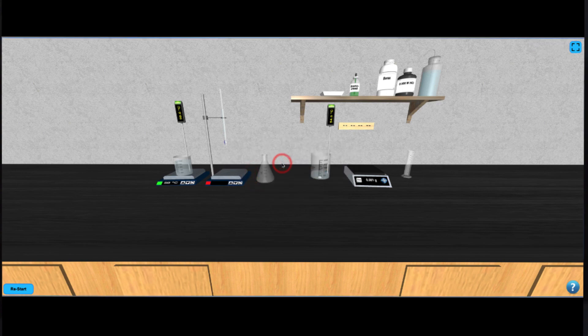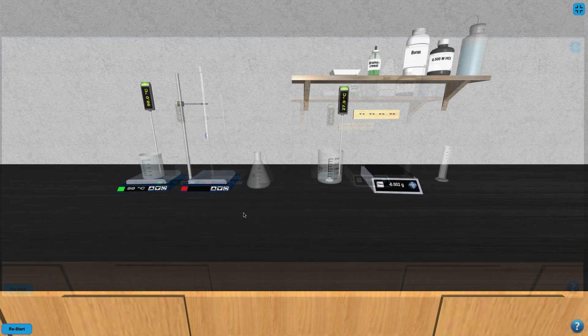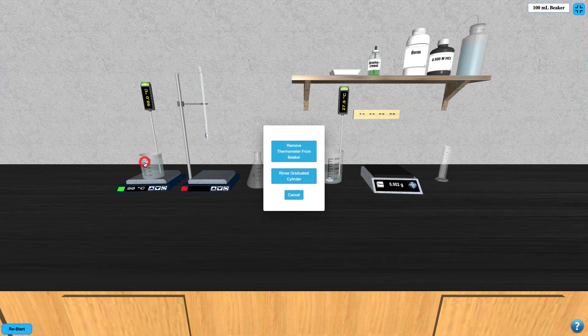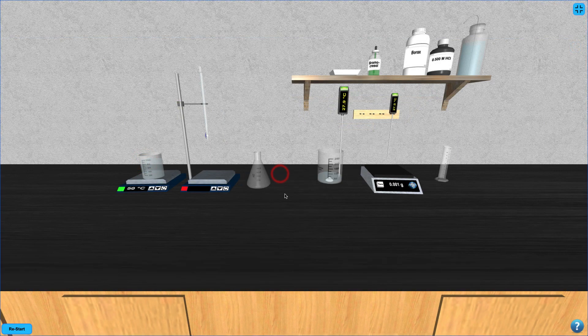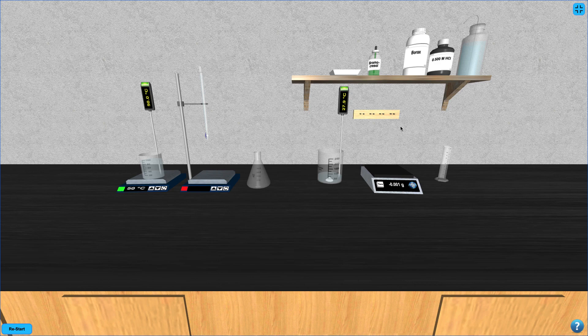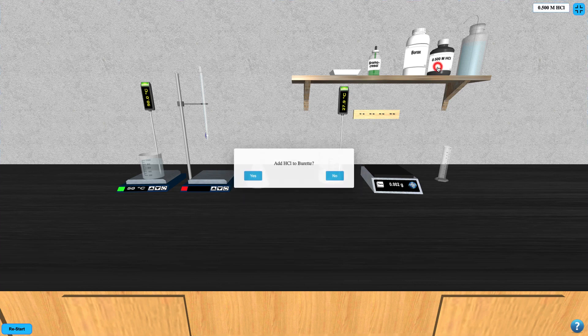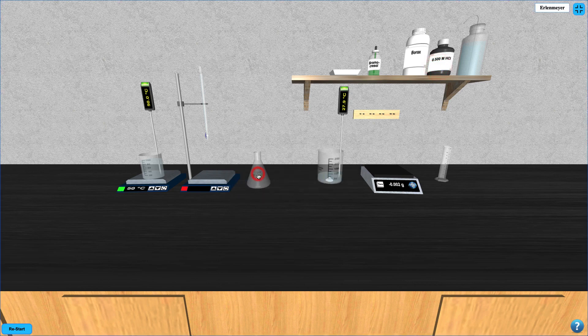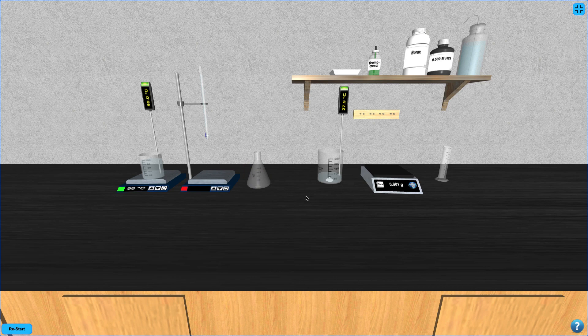Click on the 100 ml beaker to rinse the graduated cylinder and then refill the burette with HCl. Again, don't forget to note the starting volume of the burette because it isn't always at exactly zero.